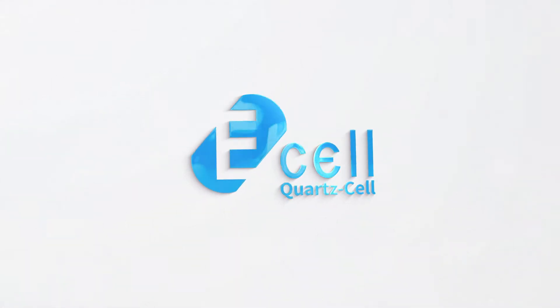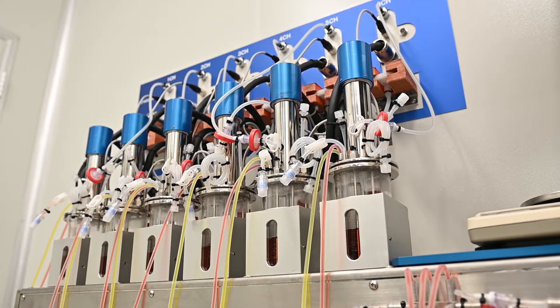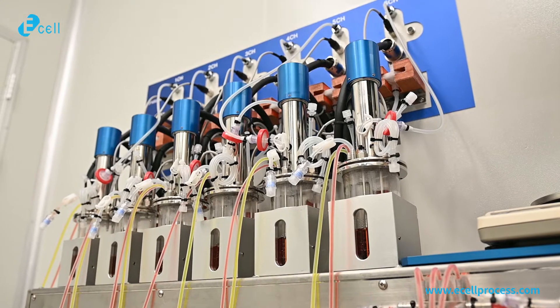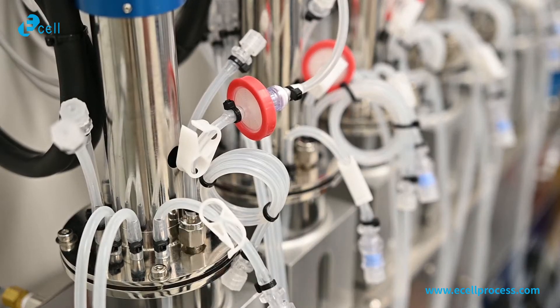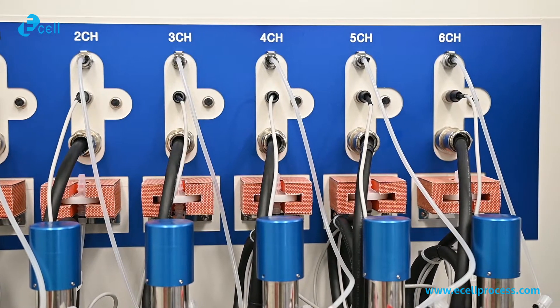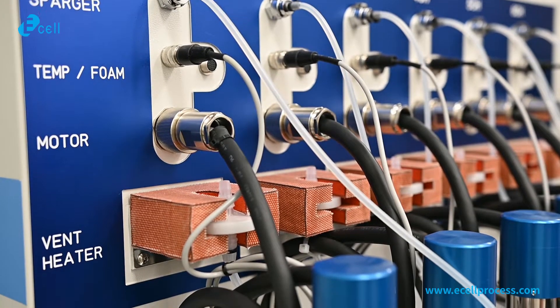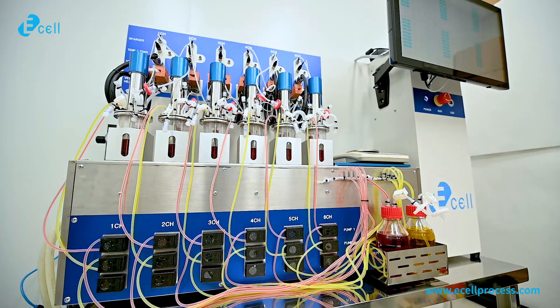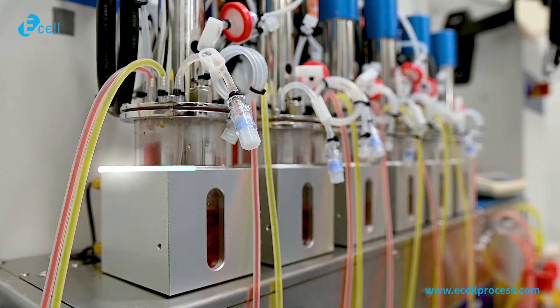We are very glad to announce our newest single-use mini-multi-bioreactor system. Usually, process development stage takes so long time and needs hard attention. To solve those bottlenecks, we developed our new mini-multi-single-use bioreactor system. The E-cell mini-multi-bioreactor system is specially focused on screening, characterization, and optimization with a fast and simple exterior design.